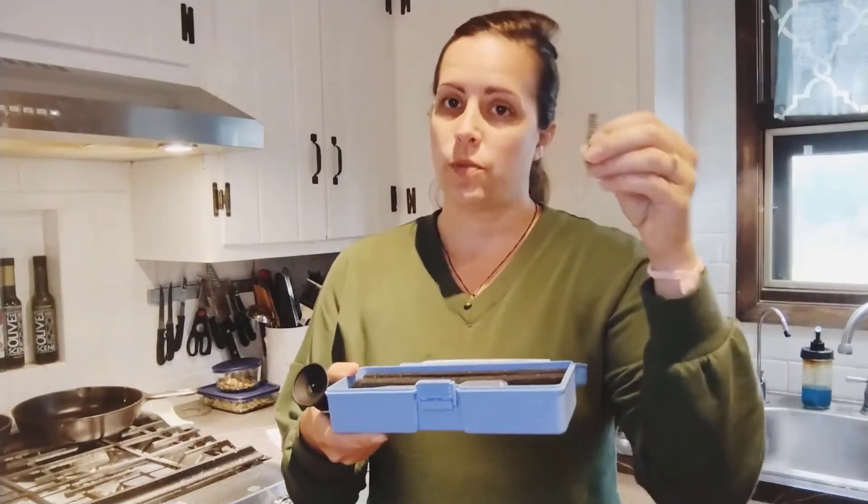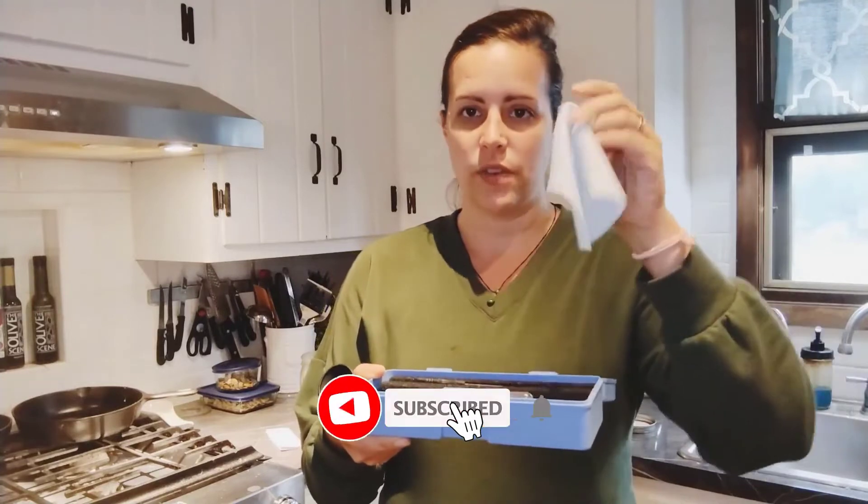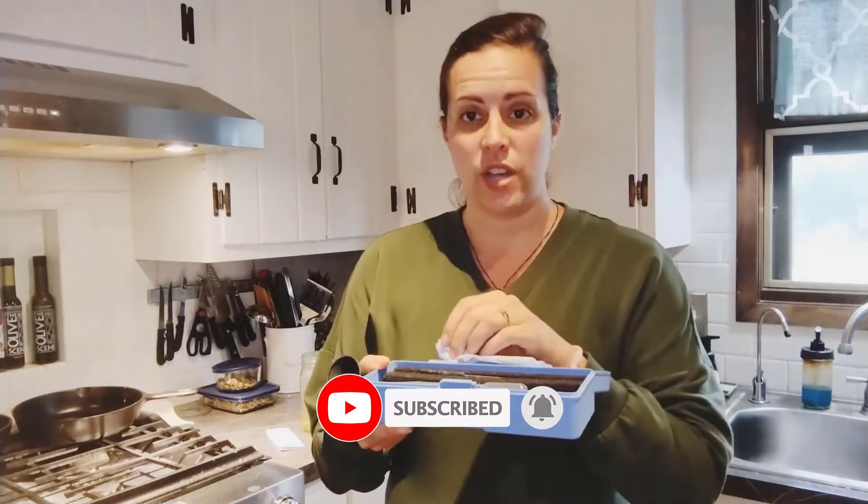Today we review the best 5 refractometers so you can choose the right one for your purpose. After spending 2 weeks of research and consumer surveys, we compiled this list.